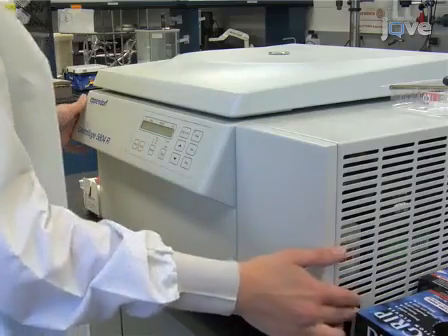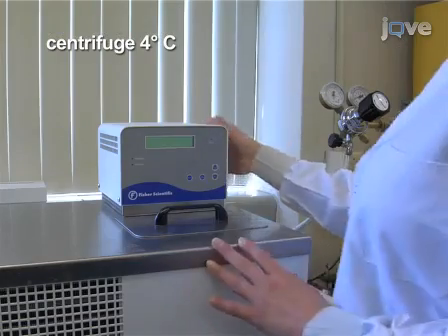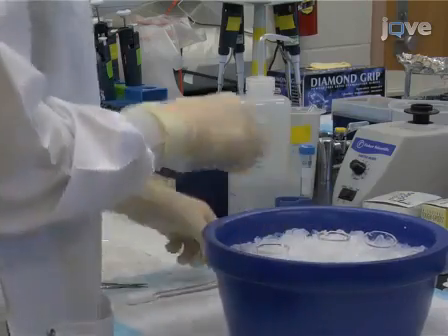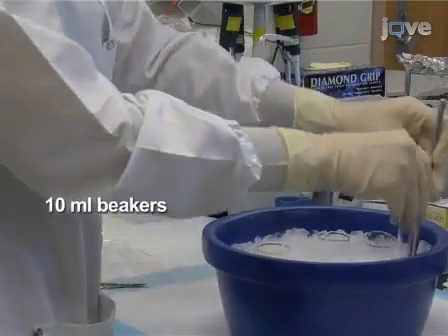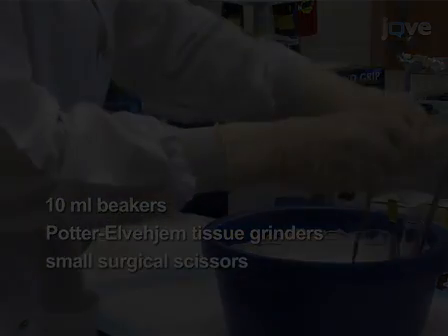Next, turn on the centrifuge and set it to 4 degrees Celsius. Turn on a water bath and set it to 37 degrees Celsius. In an ice bucket, put three 10 milliliter beakers, Potter-Elvehjem tissue grinders, small surgical scissors, and additional equipment as needed.